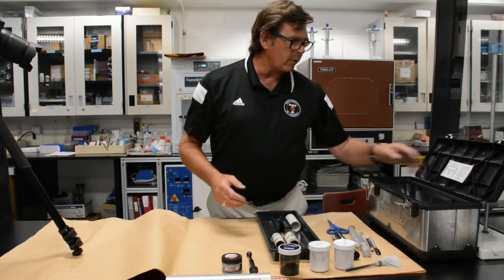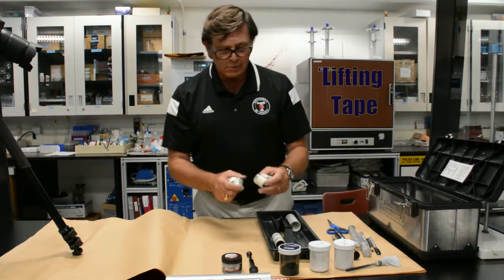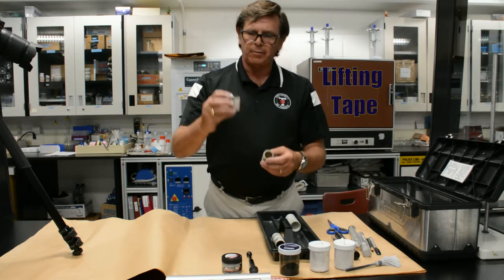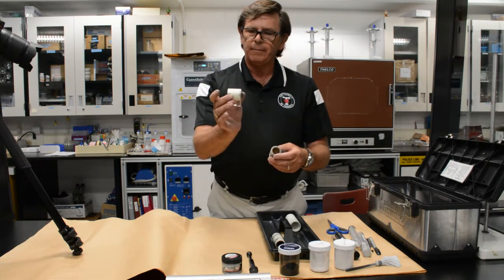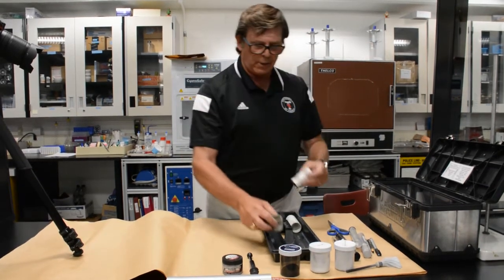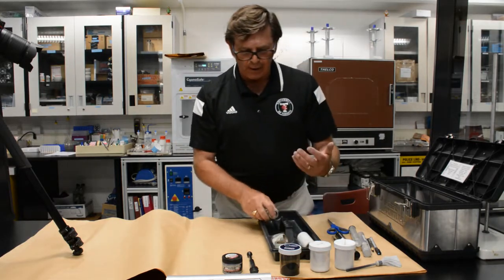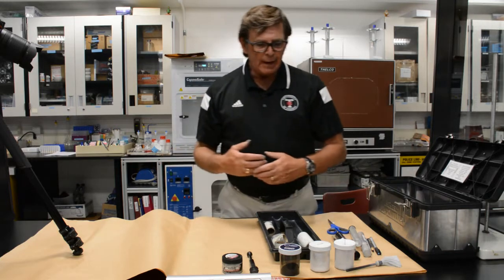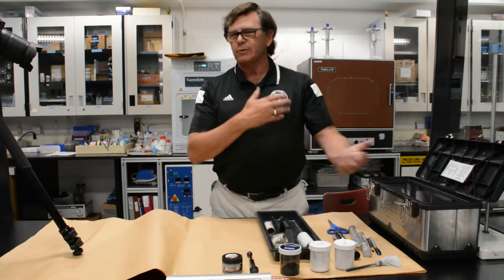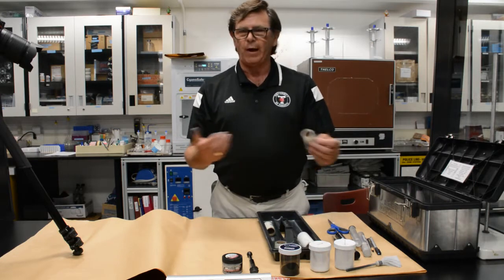So continuing on with our list here, now we have a variety of different lifting tapes, and they come in assorted sizes. These ones here, I believe, are 1.5 inches in diameter, and this appears to be about a 3-inch size roll of tape, and here's a 4-inch size. Now the tape is, again, a commercial product. Like many other forensic items, when it has the name forensics attached to it, it costs considerably more. It has an appearance similar to gift wrapping tape.